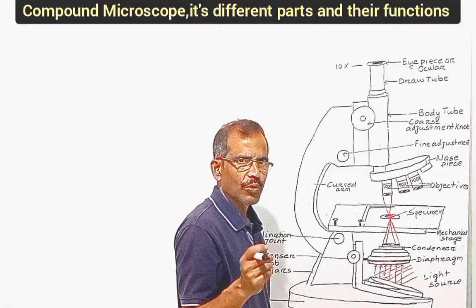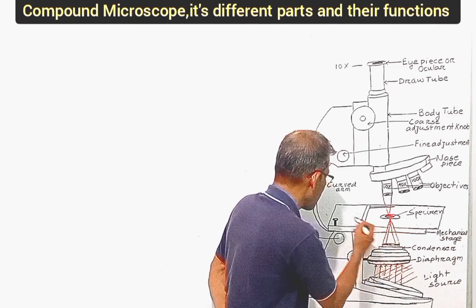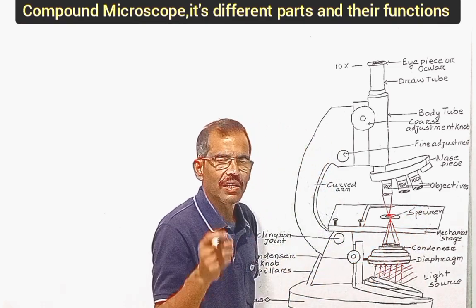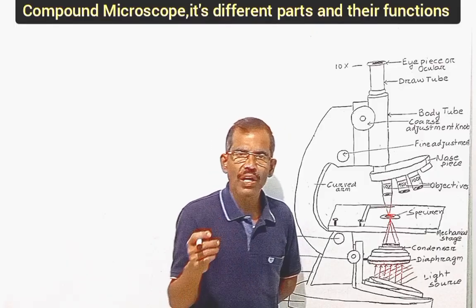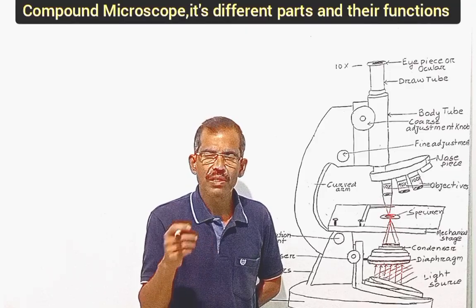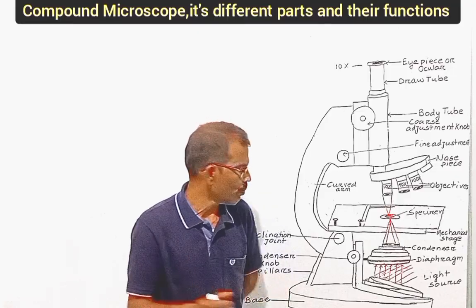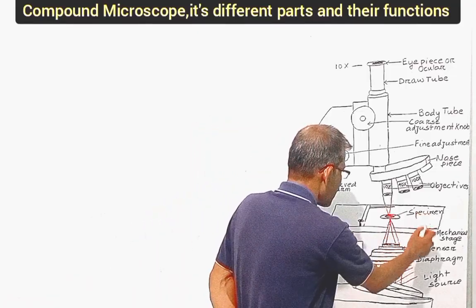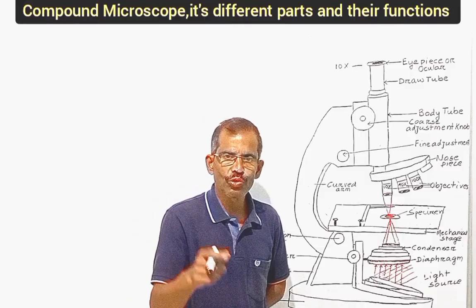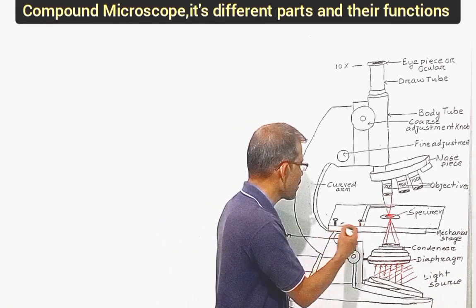In an upright microscope, above the condenser, there is a horizontal platform known as the stage on which the specimen slide is placed. There are two types of stages. One is the simple stage, which is found in a simple microscope. On the other hand, in an advanced microscope, there is a mechanical stage on which the specimen slide can be moved smoothly along the X and Y axes by using two adjustment knobs.